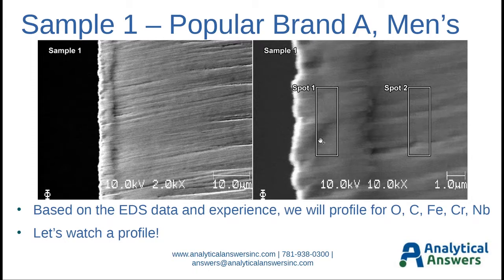When we go into higher magnification on the right, we could see that I selected 2 spots for analysis here just to see if this ridge line near the edge was actually a different material or if it was just a topographical artifact.